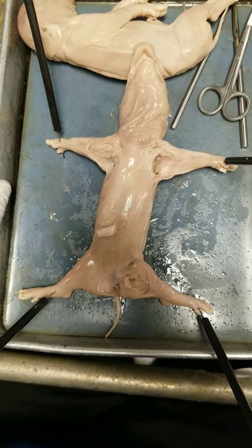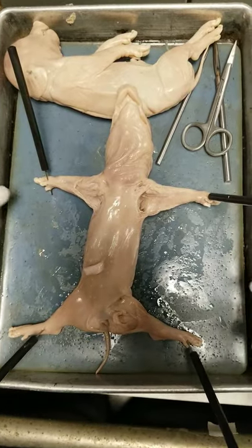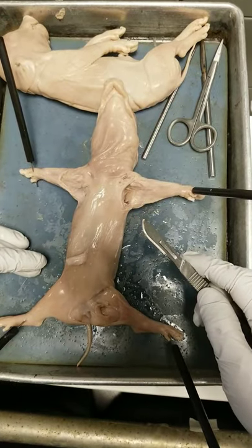Here we are back with the fetal pig, and we're going to make our first cuts. You can see that I've splayed out the pig. You can use rope or pins like I have. The goal is to have it easily spread out so when I cut it open it's easier to see and work with.